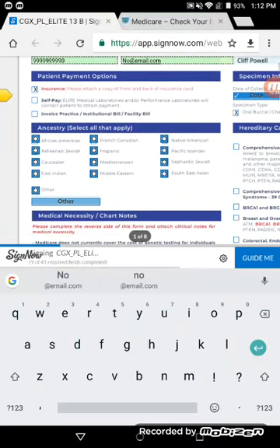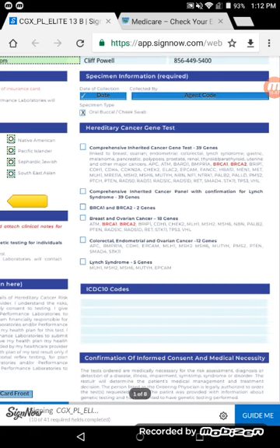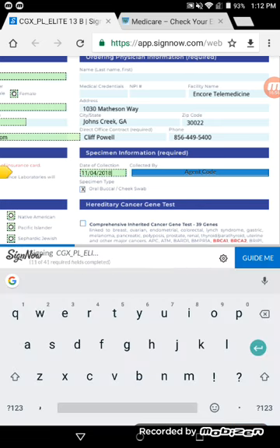Then you will click the appropriate box to their ancestry. So we can put it there, African American. Then you're going to go over to this side of the field. The day that you are doing the form, it will automatically generate that date for you.